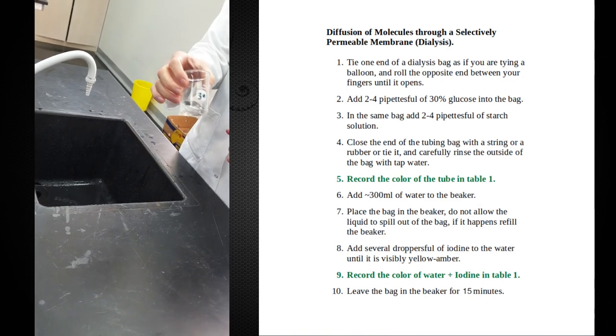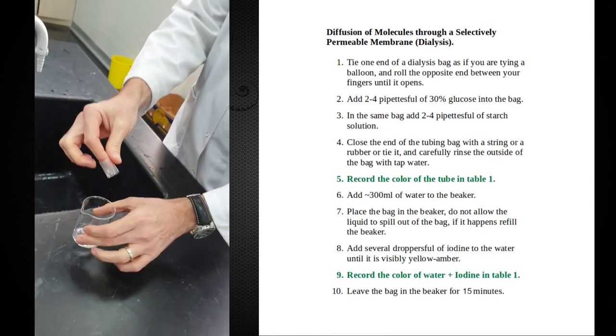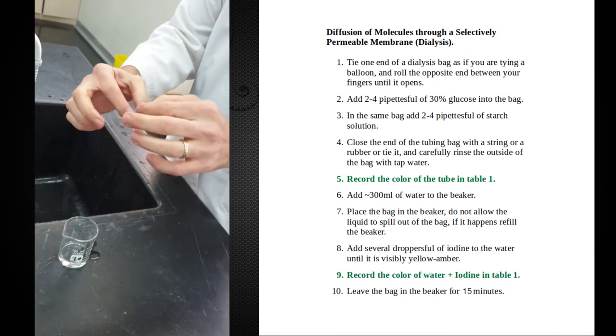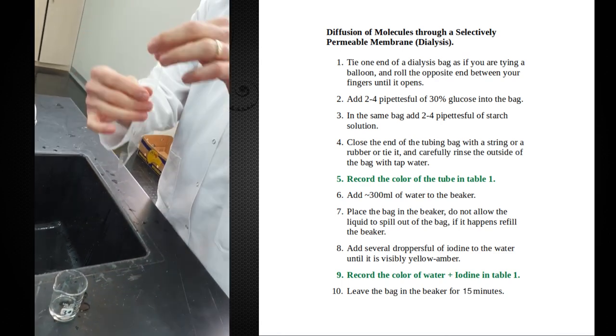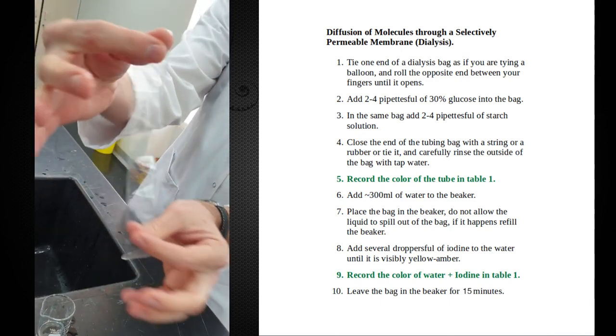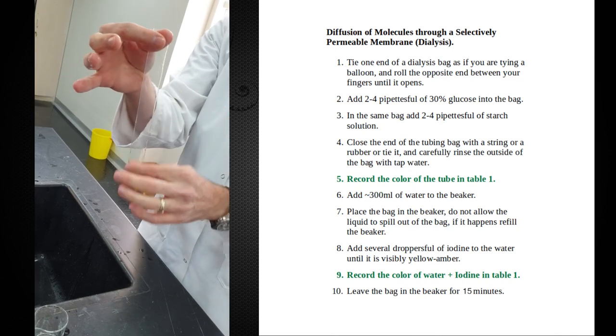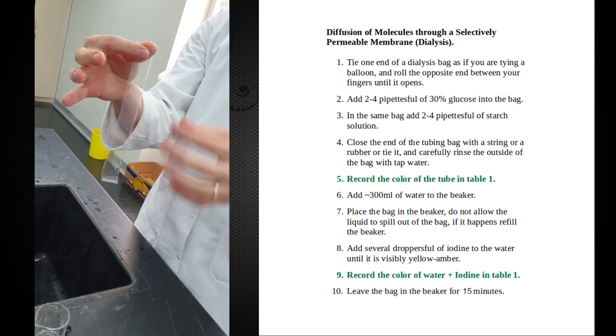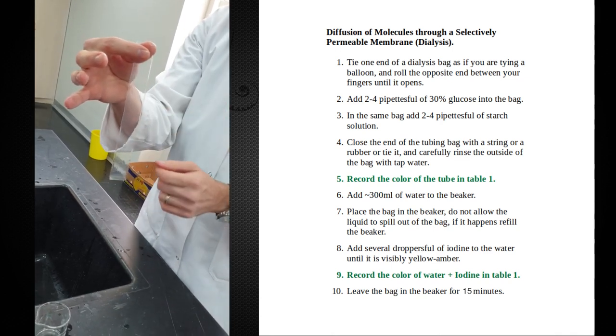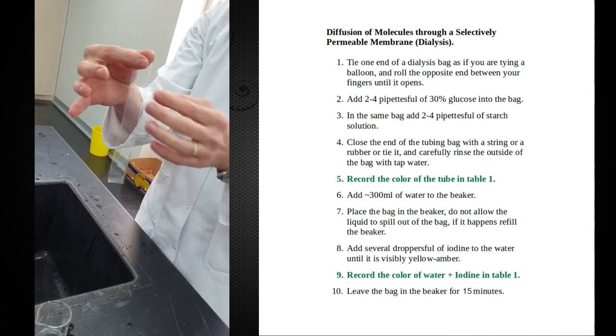Inside these beakers what we have is a thin piece of what feels like plastic. It looks very flat, there's really not much to it, just a long piece of plastic it seems. But it's actually tubing and it's special in that there are small holes that will allow certain sized molecules to pass through fairly easily and other ones will not pass through.